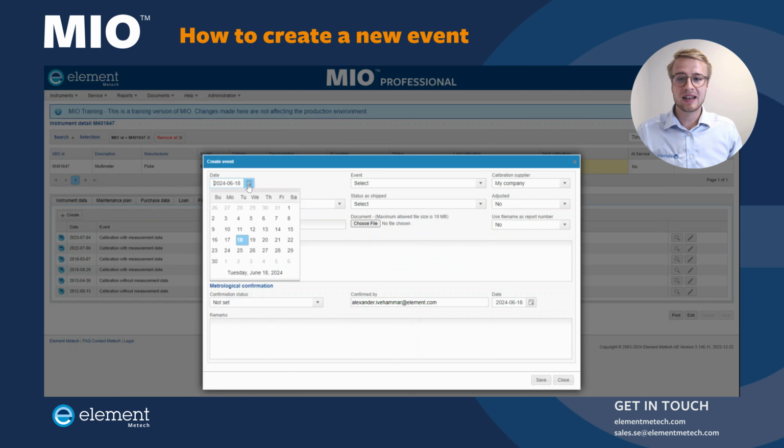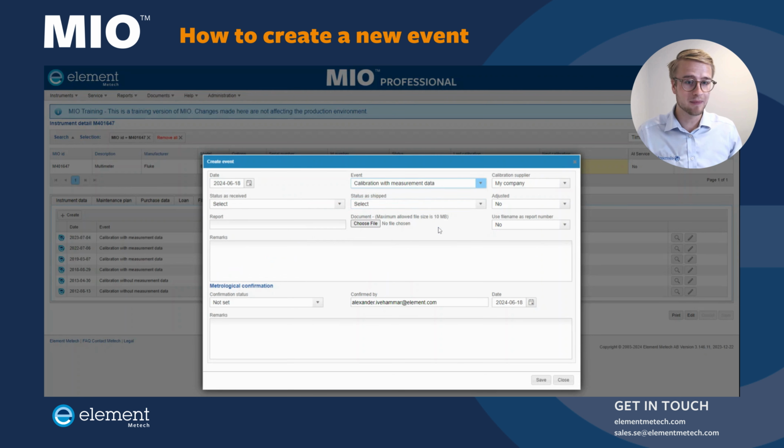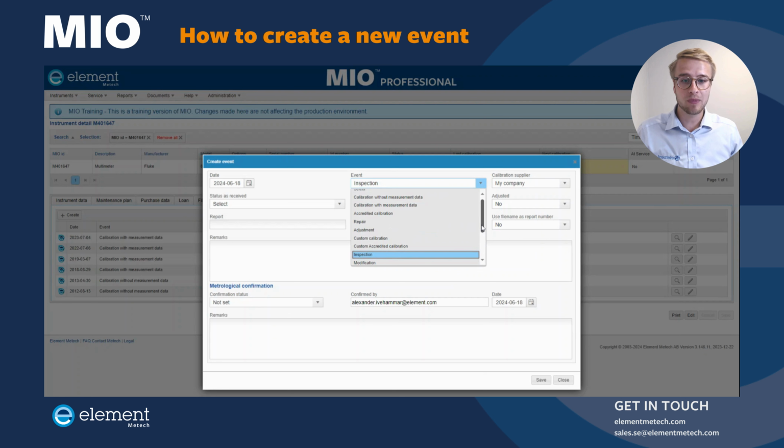I will then decide when did we perform the calibration. So let's say that was today. We're going to choose the event, which is calibration with measurement data. And here I want to note for you that there's a lot of different types of events you can register. For example, repairment, inspections, or any type of upgrading or service for a particular measurement instrument.